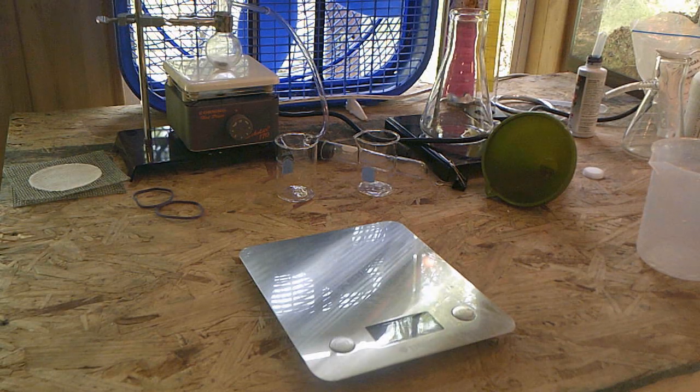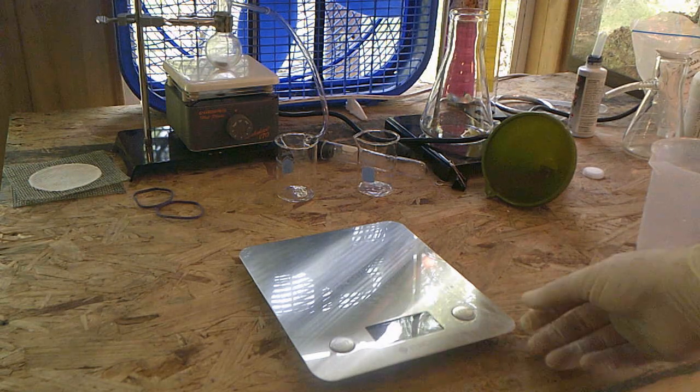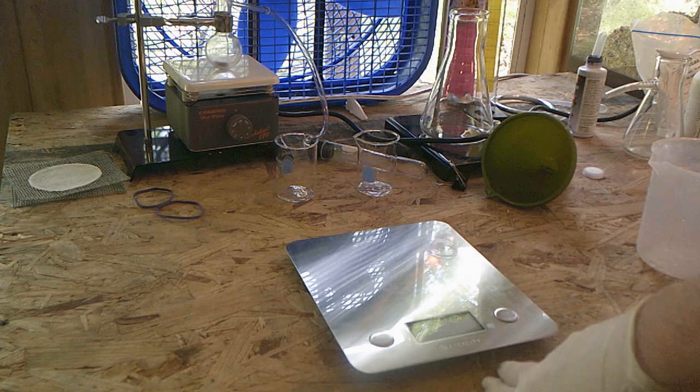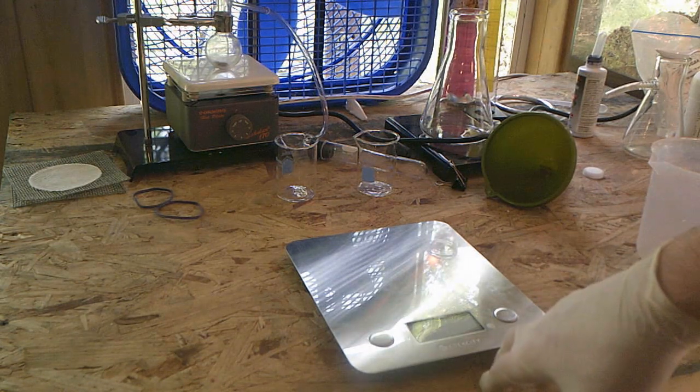All right. Hello, physical science guys, today we're going to do what's called the blue bottle reaction. And I'll use this as a phenomena to talk about chemical reactions as well as acid and base reactions. And we'll kind of walk you through it.